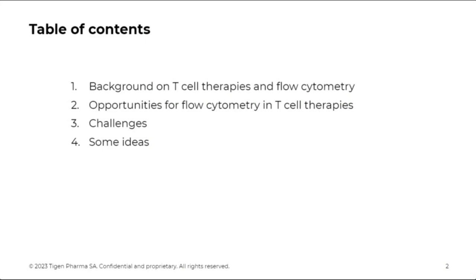What are the opportunities really when we use this for T-cell therapy in the manufacturing space? From there, I will go into the challenges, giving you an overview and a little bit more specifics. And from there, I will share some ideas that I think may help in qualification and validation of the flow assays.